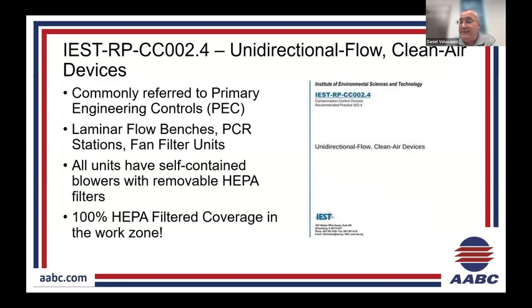So the next IEST recommended practice is 002.4, unidirectional flow clean air devices. In the pharmacy world, in the certification world, you may hear these called hoods, benches, BSCs, or primary engineering controls. That's a term that's coming out now, started in about 2016. You're starting to hear it more and more as engineering firms get into hospital pharmacies and USP work. PEC is used in that document a lot.